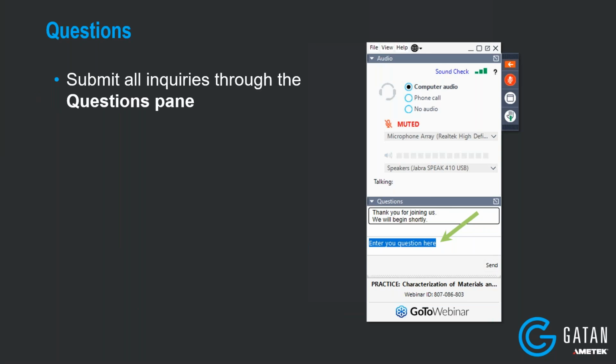You may already have the license, and DigitalMicrograph just needs a setting to be set so that you can control your holder. But if you don't have the license that's required, you can request that from your local Gatan salesperson or distributor, and those are free licenses.